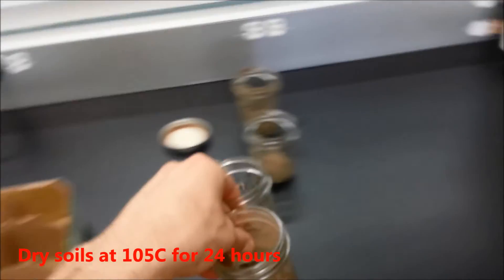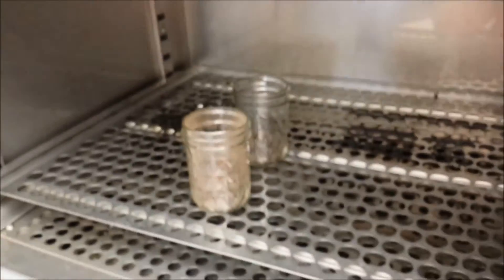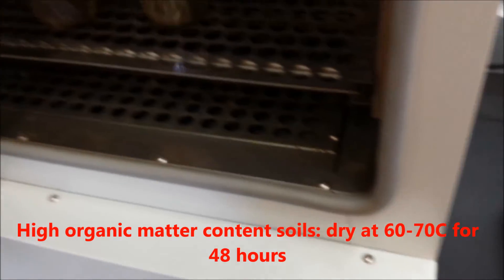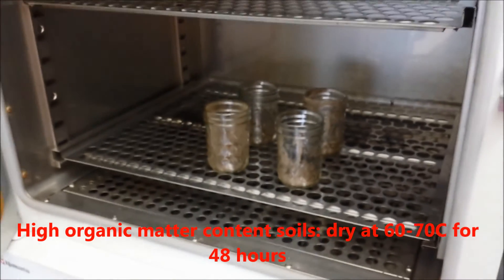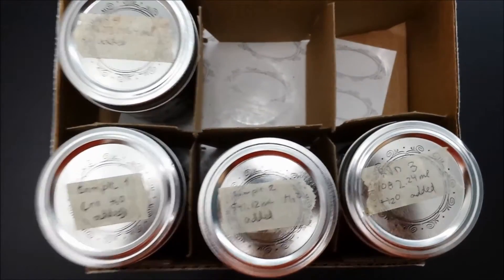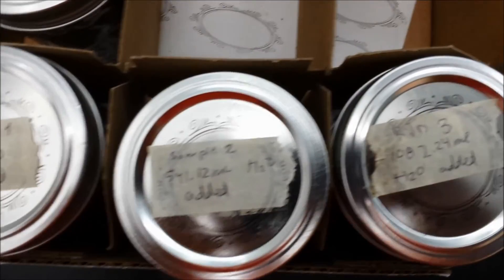Place the soil samples without lids into an oven. Note that soils with high organic matter content may lose organics if dried at 105 degrees Celsius, leading to error in calibration. Dry these soils at 60 to 70 degrees Celsius for 48 hours. Once the samples are dry, replace the lids, label each sample, and record their respective weights.